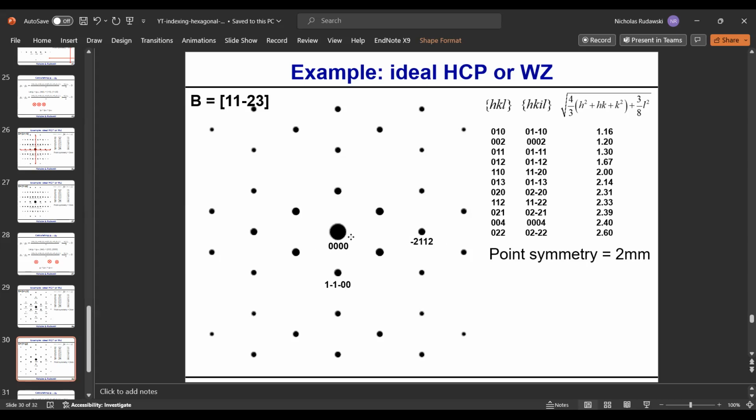First thing we got to do is figure out the 3 index direction here for 1, 1, 2 bar 3, as well as 1, 1 bar, sorry, there isn't a bar 0 there, as well as 1, 1 bar, 0, 0. So let's do this for this guy first.